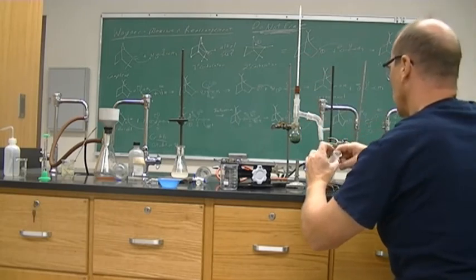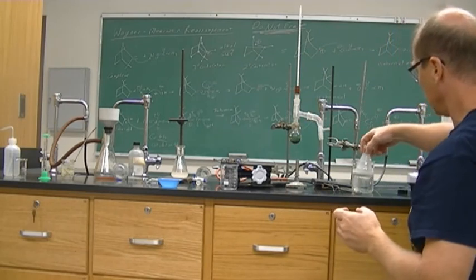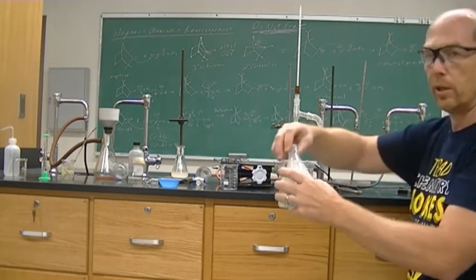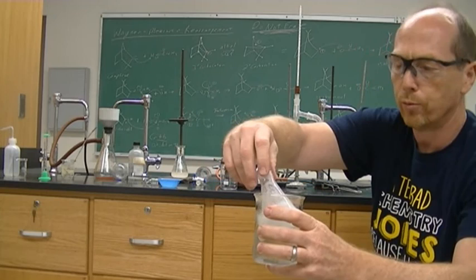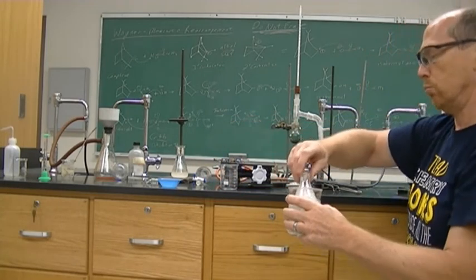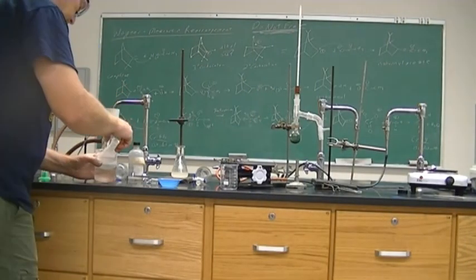Great, except for a little bit of green tint. Hopefully that goes away when we filter it. But it is a white solid on the side. That's what it's supposed to be, a white solid. So hopefully the green solution goes through and we have our white, it's a near colorless solid.